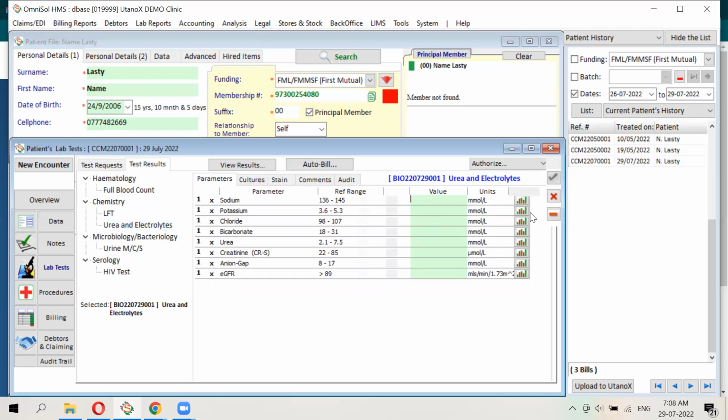These are quantitative. I mean, there isn't much of a difference in terms of the other tests we already illustrated, since it's really just values that you're entering here. But again, we would expect that you don't have to enter this manually, because the equipment will be interfaced.